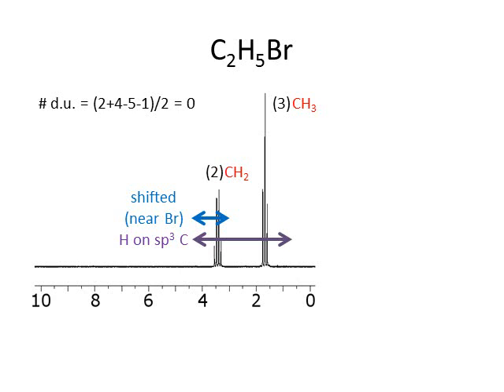There are some instances where that would be 2 identical CHs, and so on. And the last thing is splitting. Now, if I look at the splitting pattern, this signal is for a CH2, but the splitting tells me what it's next to. And here the splitting pattern is a quartet. If we go back through our understanding of splitting, if I am adjacent to 3 little magnets, I will be split into a quartet. That is, if I am next door to a CH3. So the fact that this is a quartet tells me it's next door to 3 hydrogens.